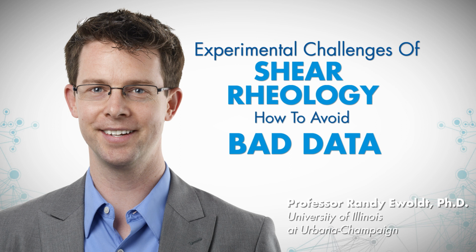You expect that the normal stress should grow like the velocity squared. When you change direction, it doesn't change sign. The risk there is that that's exactly how inertial stresses also grow. They grow like the velocity squared, like the Reynolds number squared, as you saw in the example with the shear loading with the torque. So I don't have any examples here. If I were to do it, that would be the biggest risk.